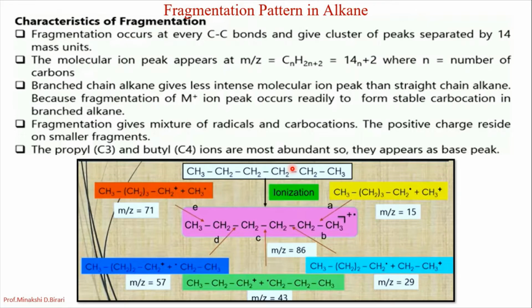So here, each and every carbon-carbon single bond is going to cleave. Therefore, as there are 5 carbon-carbon single bonds, the cleavage occurs in 5 different ways. So we can fragment this molecule in 5 different ways. It is hexane, a straight chain alkane, and we get the cleavage in 5 different ways. Each and every carbon-carbon single bond is going to cleave so that we get a number of fragments. So let us see one by one.